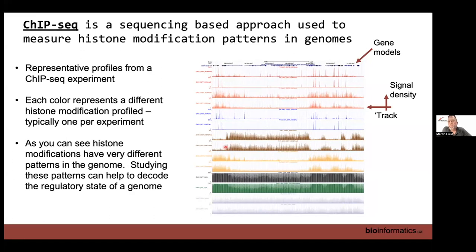So, what can you see from this data? Well, you can see the patterns of the ChIP-seq. You can see the relationships between the marks. You can see that some marks are correlated, some marks are anti-correlated. You can see, if we look at DNA methylation, which is shown here, and the height of the histogram here indicates the level of CpG methylation, you can start to see relationships between histone modifications, in this case K27 trimethylation, and DNA methylation. So I hope you can appreciate that there's a pattern here that seems to mirror the occupancy of K27 trimethylation, showing the well-known relationship between these two marks.